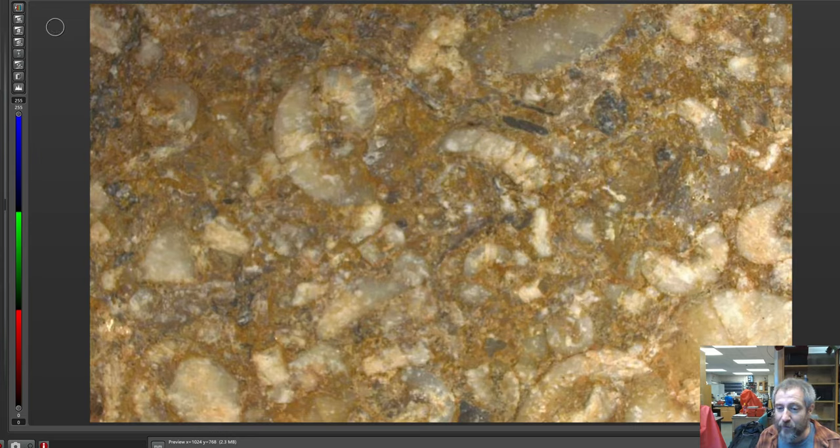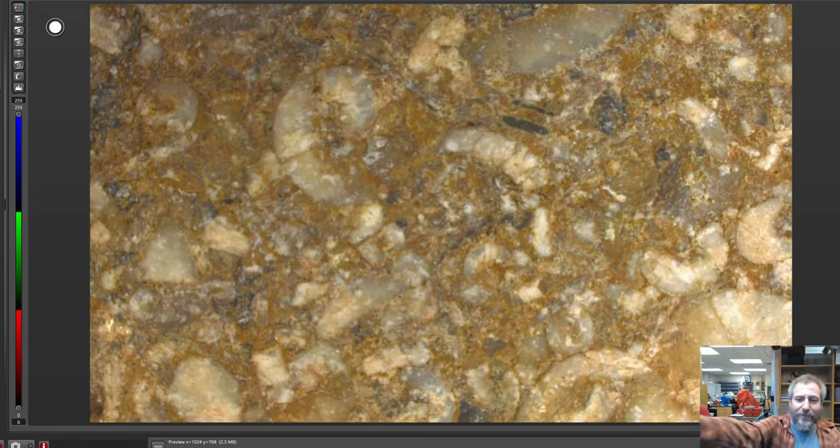And in here we have just the microscopes, the light microscopes. I've got sitting beside me a microscope like the one that's at home, and this thing back here with the dust cover on it is another microscope, my first one in the lab. This is actually the third one. And the light microscope that we're looking through is over here. Can't really point the camera at it because the camera's built into the screen, but it's a stereo microscope. So I have a light side lab and a dark side lab, and I'm usually in the dark side with the electrons for streaming purposes.